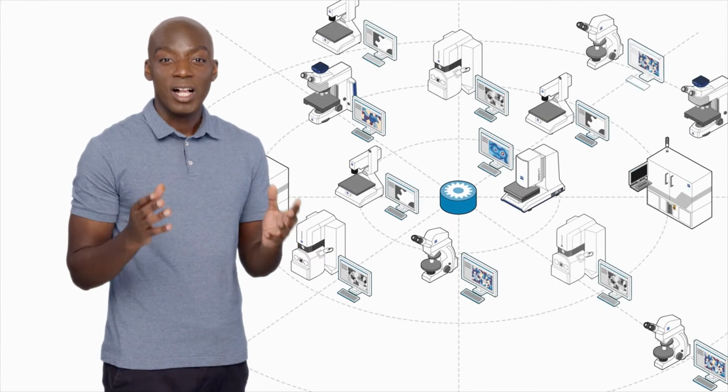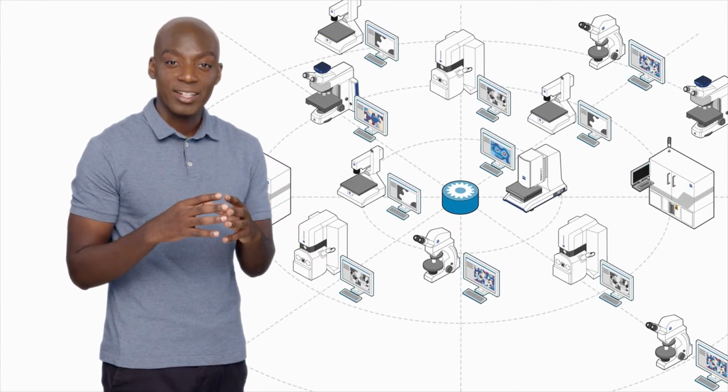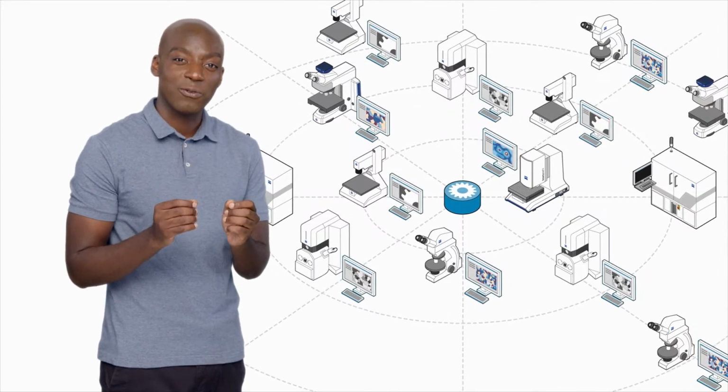SmartSEM Touch is part of the ZEISS software suite, helping you to control, connect, and interlink all kinds of different microscopes. If you want to know more, have a look at my other videos.